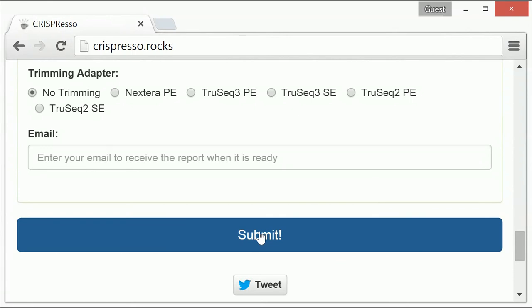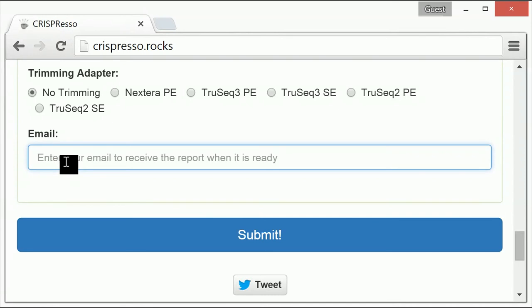If an email address is entered in the field directly above the submit button, then you will receive an email when the CRISPResso analysis results are ready. If this field is empty, you will need to leave your internet browser open to view your results.